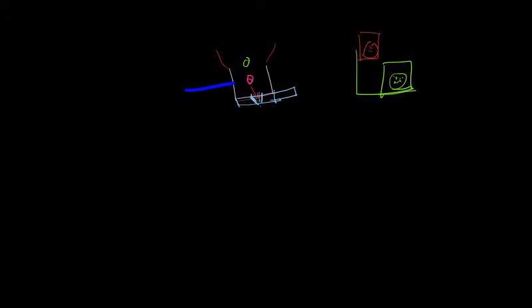There are two purposes for the nozzle. One is that we have control over the stream, and number two, the nozzle is used to vibrate. There is a piezo actuator associated with the nozzle, so the nozzle can vibrate. Why do we need to vibrate the nozzle at all? If you have a fine orifice here, it will make a fine stream.